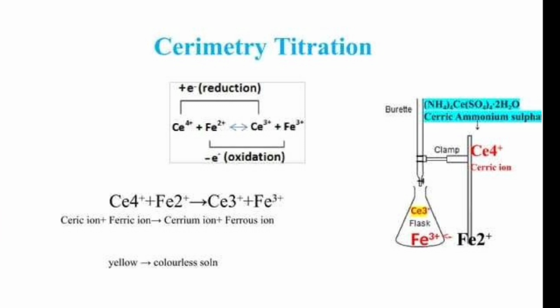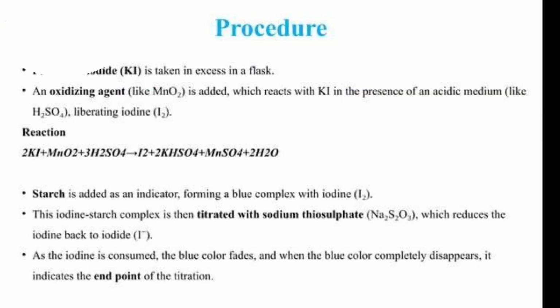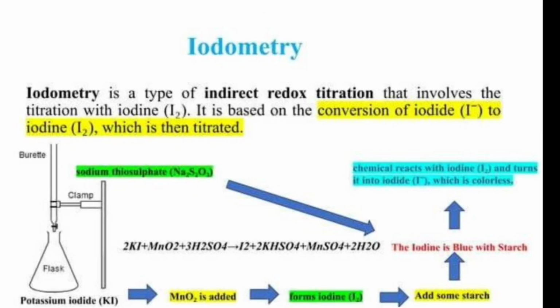In today's class, I discussed the following terms: cerimetry titration, the applications of iodometry, and what is the principle of iodometry.